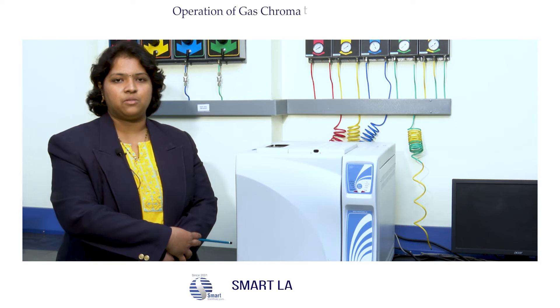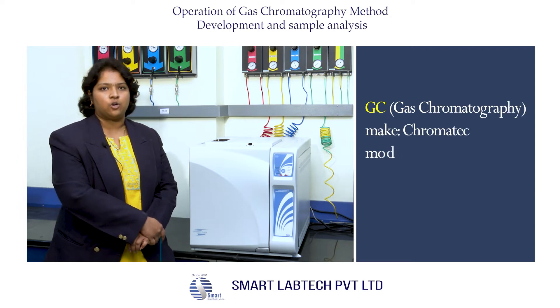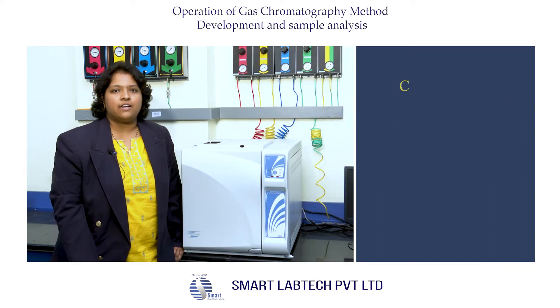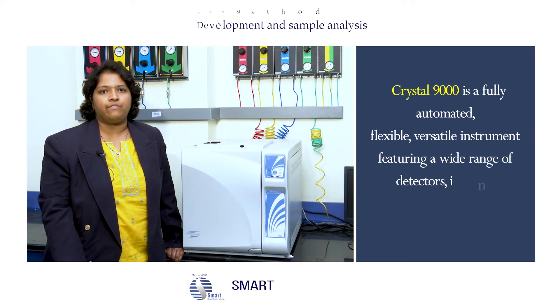Hello everyone, welcome to Smartlaptic. Today I am going to show you the operation of gas chromatography — the Chromatic instrument from Russia. The model is Crystal 9000. Crystal 9000 is a fully automated, flexible, versatile instrument featuring a wide range of detectors.